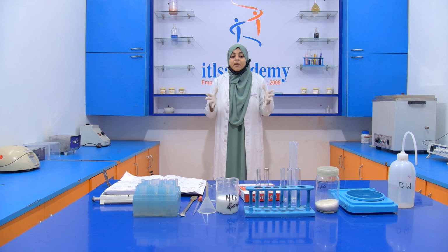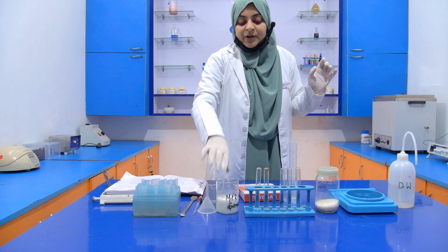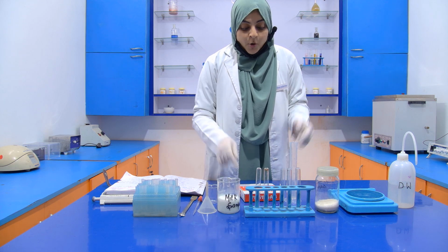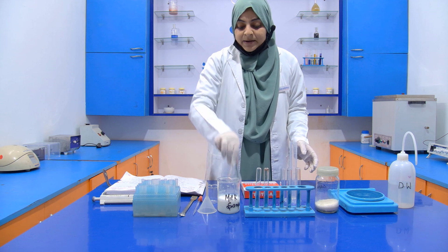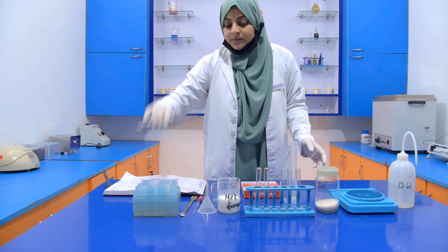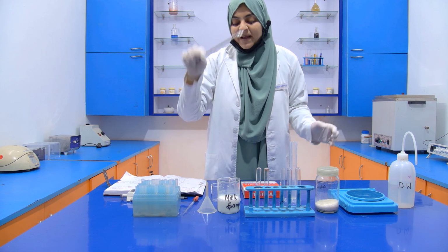For performing this experiment, we require this setup. First of all, we require milk as a sample. Then we require a filter paper, conical flask, beaker, micropipette, micropipette tip, spatula. This is the spatula.